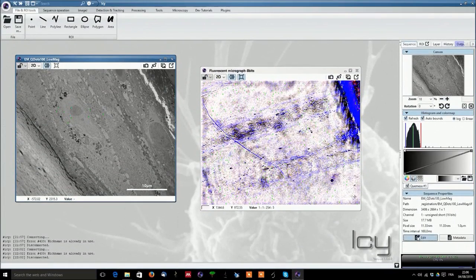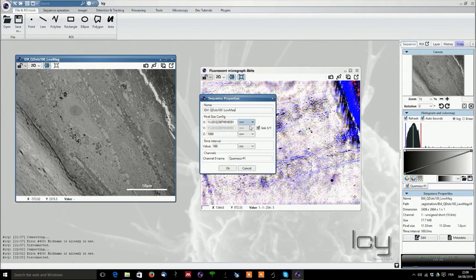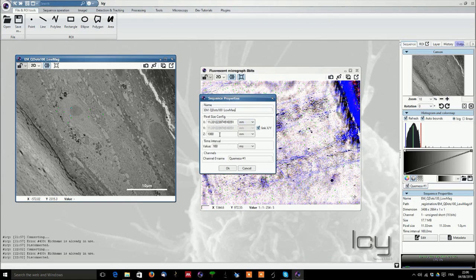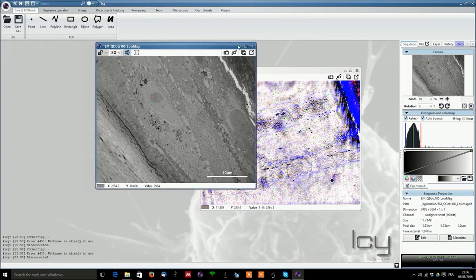You can also edit the different sequence properties like you can change the name of the picture. You can also adjust the pixel size according to what you need and the values, the z as well. And you can change the name of the channel. Here camera corresponding to channel 0. We will see later on that we can use several channels and have a name per channel.